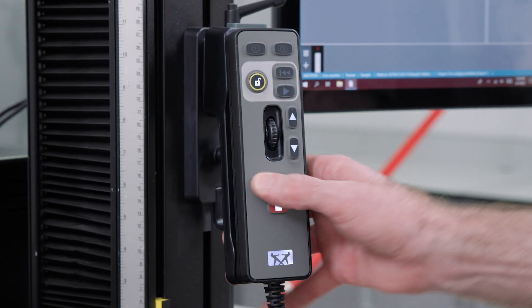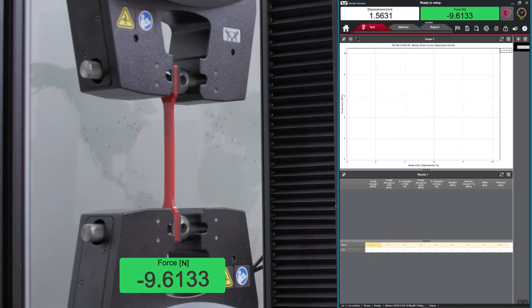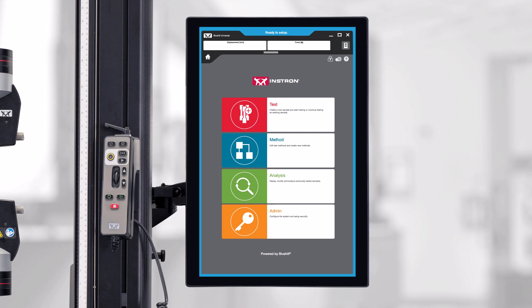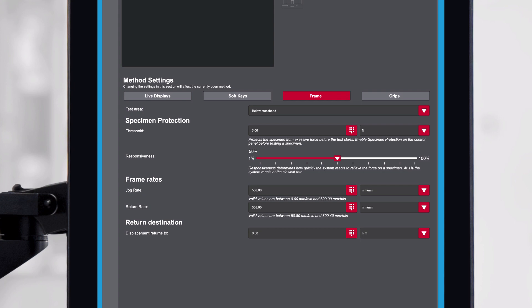Now when I press the Specimen Protect button on the handset, this load is automatically removed through the motion of the crosshead. We can set the Specimen Protect load threshold in Bluehill Universal by clicking on the system icon and navigating to the frame menu. From here, you can set your load threshold as well as the responsiveness.